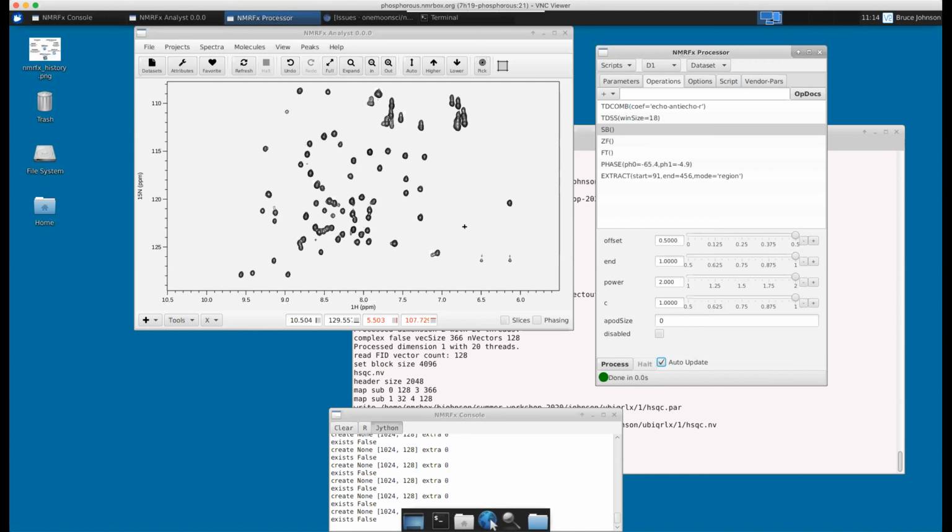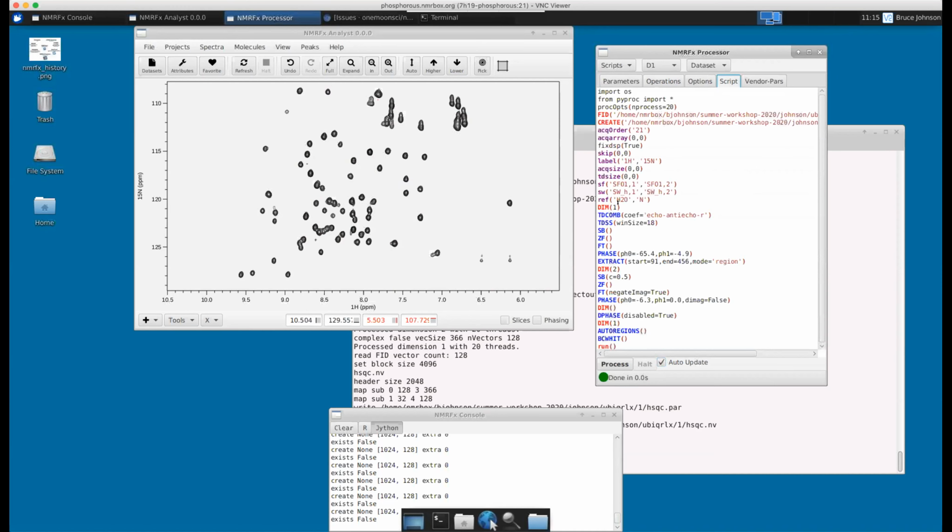Hey, Bruce, it's Doug again. I put my hand up. For the, you said you could script in Python like a for loop and loop over, for example, a series of spectra. Would that require like the proper Python tabbing? Oh, absolutely. When I say Python, technically it is Jython, which is a Java implementation of Python, but it basically is Python 2.7 and works like Python. So yes, for people that are Python users, they know that Python flow control all relies on things that are indented. So yeah, it has to look like a real Python script.